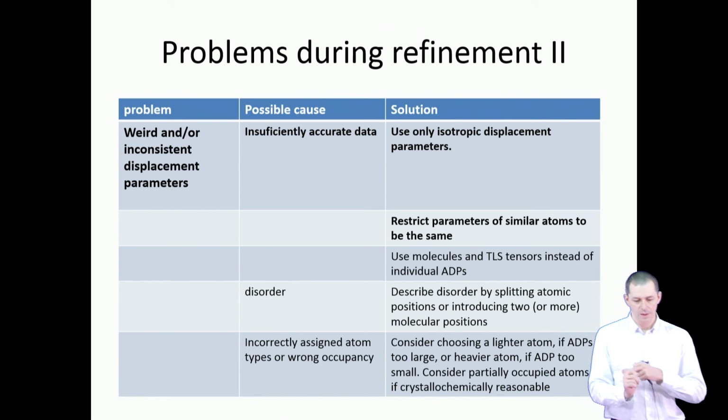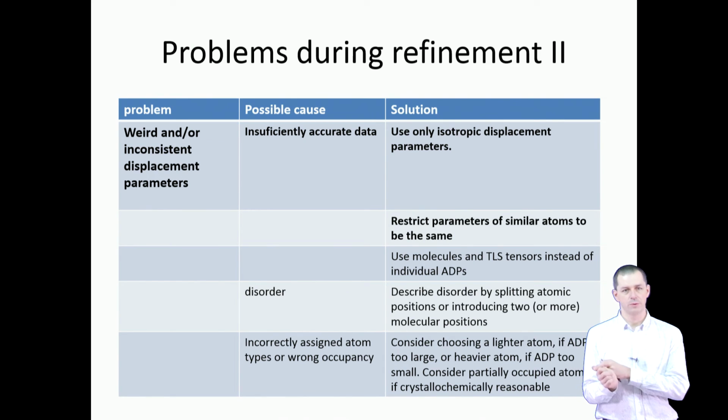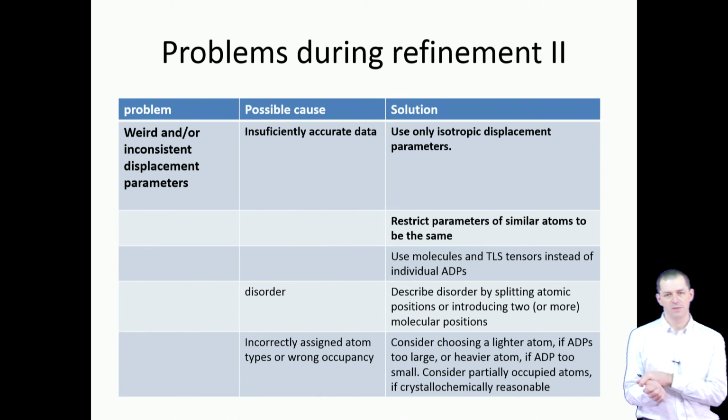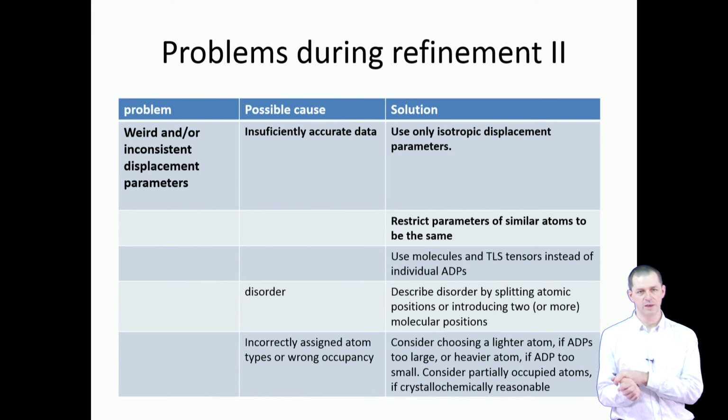One cause may be wrong absorption correction. That's actually one important cause for poor displacement parameters, and for today afternoon we prepared for you one example that shows how this can be the case.